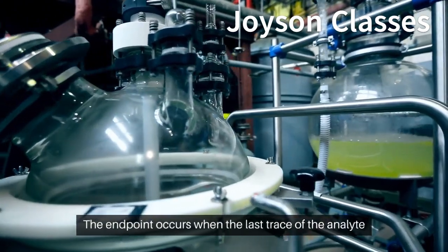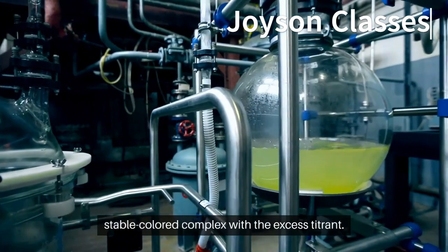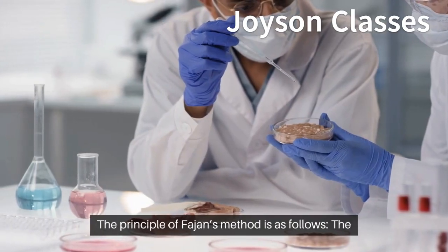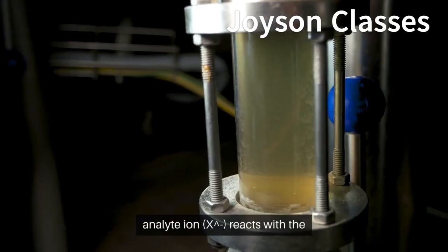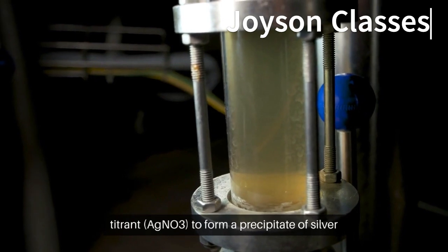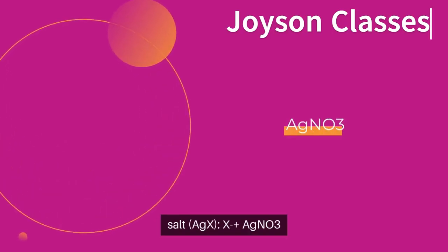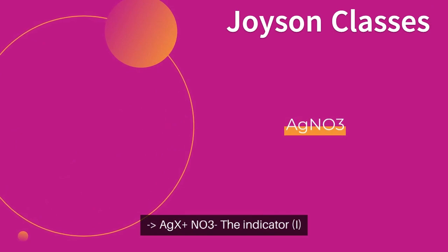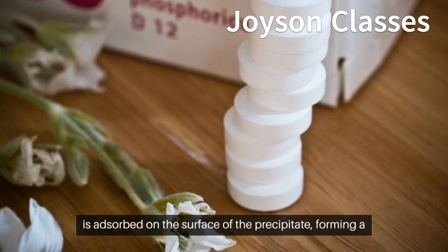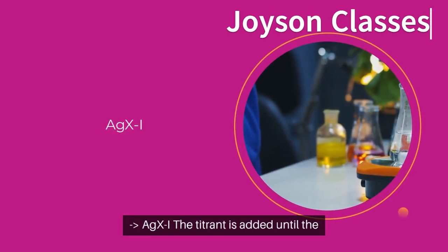The endpoint occurs when the last trace of the analyte ion is precipitated, and the indicator forms a stable colored complex with the excess titrant. The principle of Fajan's method is as follows. The analyte ion, X⁻, reacts with the titrant, AgNO3, to form a precipitate of silver salt, AgX. X⁻ + AgNO3 → AgX + NO3⁻. The indicator I is adsorbed on the surface of the precipitate, forming a colored complex, AgXI. I + AgX → AgXI.